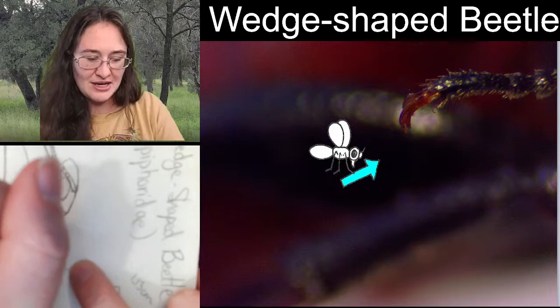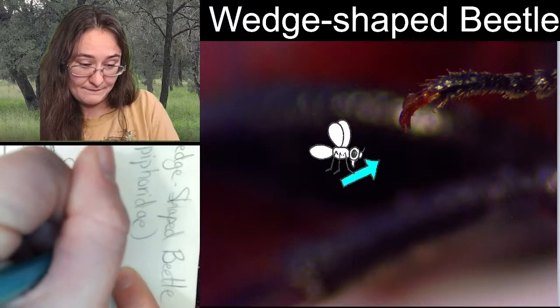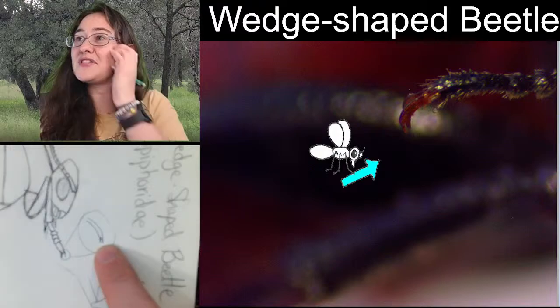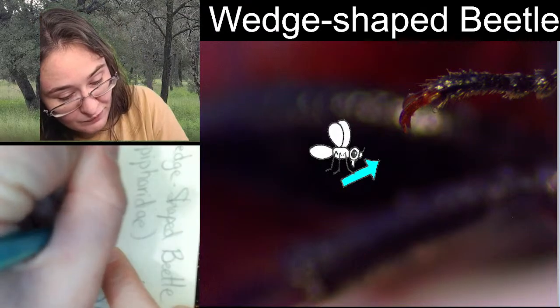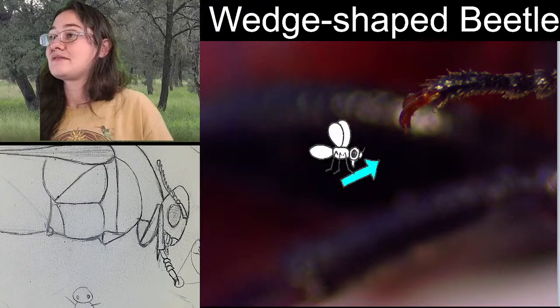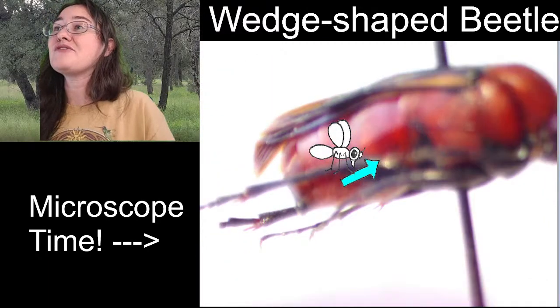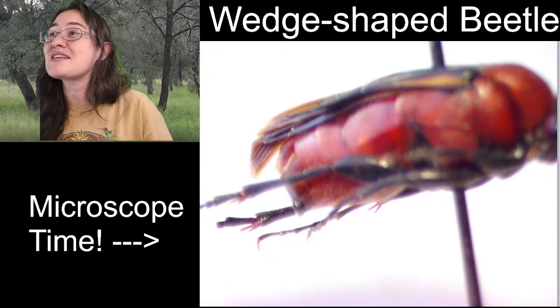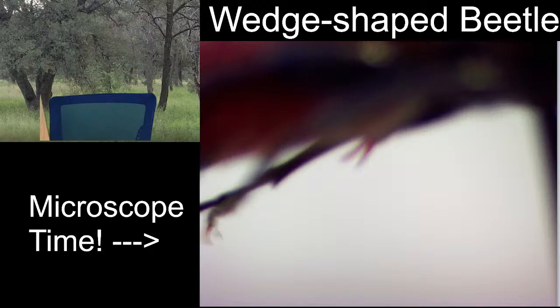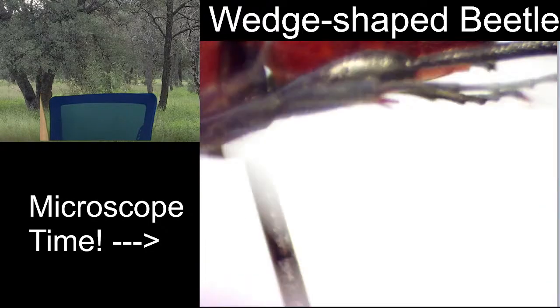So each one of those claws, if we were going to zoom in right here on the end of that claw, it looks like that, where it's split at the end. All right. Middle leg. I believe the middle leg is going to be very similar to the front leg. I'm going to switch over to the middle leg on the other side, see if it's behaving a little bit better. Yep, much better.